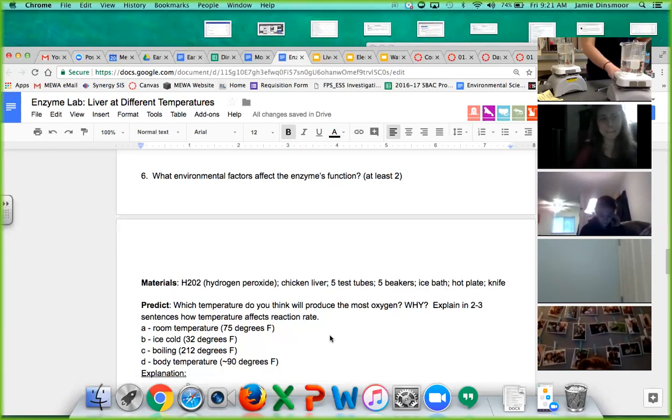And let's see about our room temperature guy here. All right, so what we're gonna do is take some hydrogen peroxide, brand new, which is good because these can actually expire if you guys weren't aware of that. They do decompose over time. And we're just gonna pour it into an empty test tube and make some observations here about what is going on.